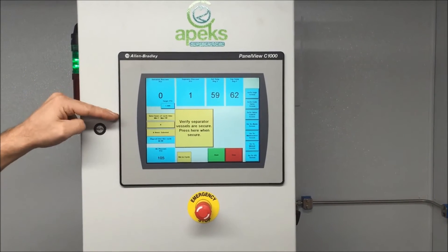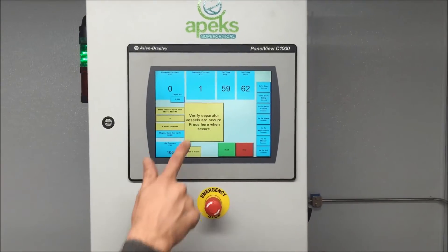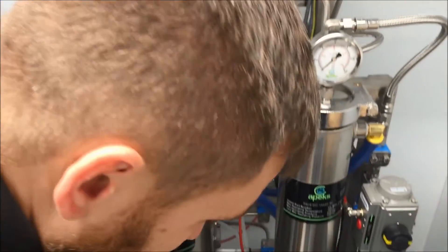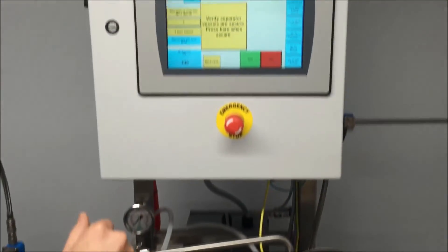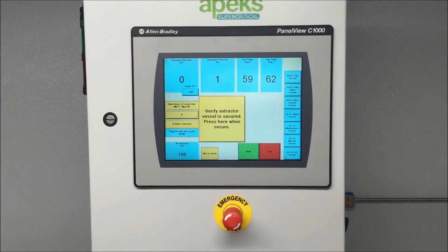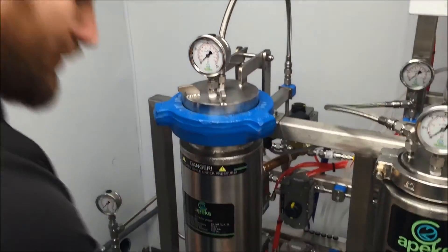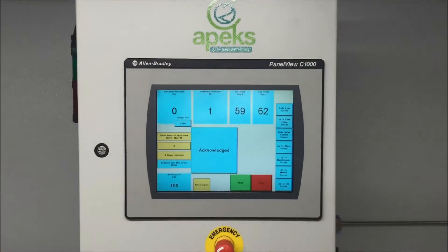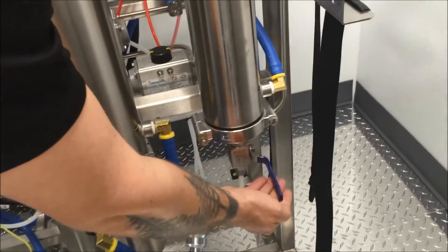So we entered pressure, we entered time, we just entered temperature. Now it's going to remind us to check a few things. It's saying verify your separator vessels are secure — we're going to check the four clamps that are on our separator vessels. Those all look tight, so we're good. Then it asks us to verify that our extractor vessel is secure — we'll come over here, make sure it's hand tight, check the bottom, make sure it's hand tight. Then it asks us to close valve 10, so we'll close valve 10. At the end of the run it'll ask us to open valve 10, so for now let's keep it closed.